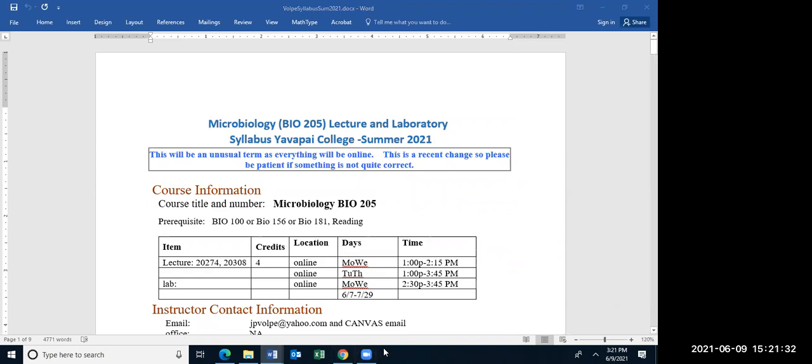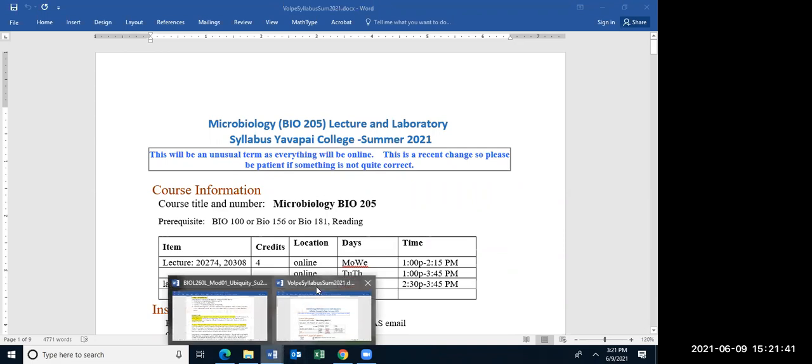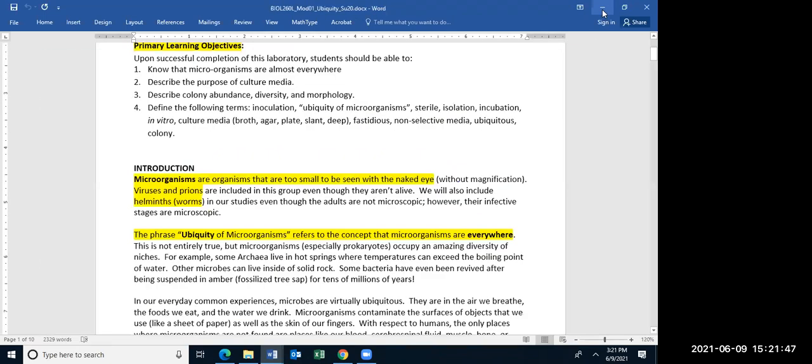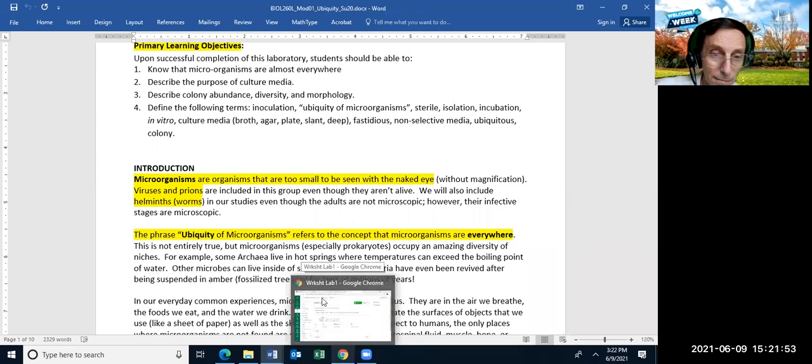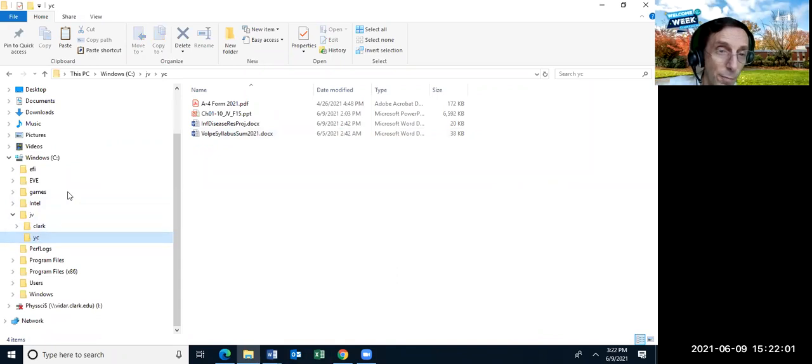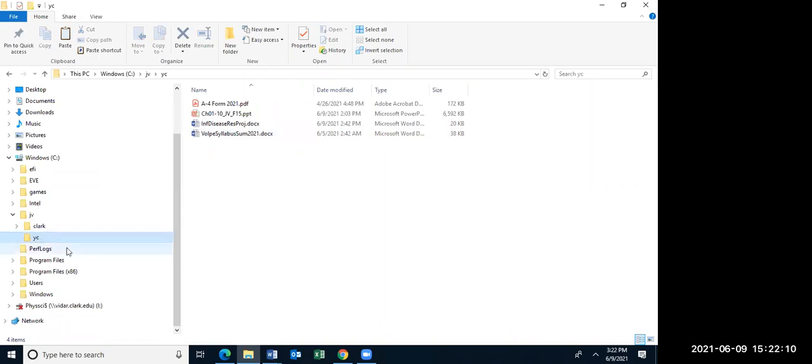I do have another question just looking through this. For example, procedure 5, are there microorganisms in the soil? And so it's as if we've already inoculated, like incubated this, and that's what we see then? I'm not sure I understood the question. Can you repeat that? Well, it says in procedure 5 to collect some soil, which obviously we're not doing. Well, yeah, everything you're doing will be done online. We're just looking at the picture, and that's basically the result that we got. Is that correct? Correct.